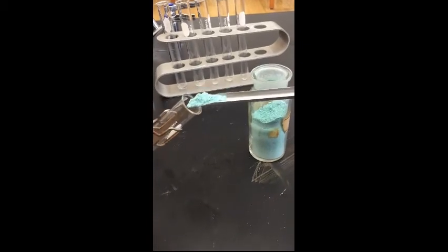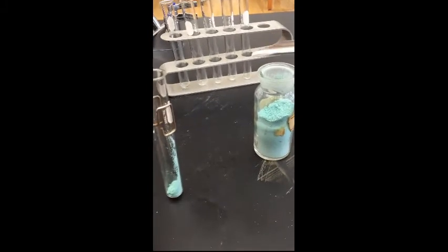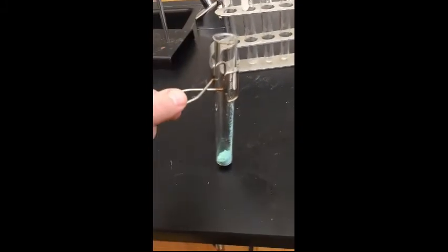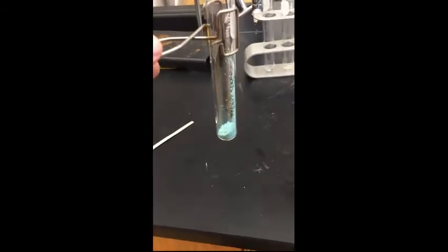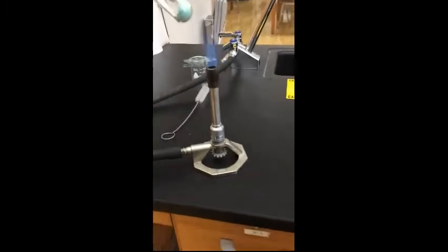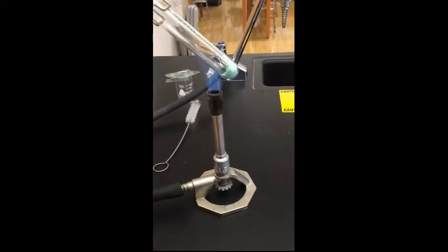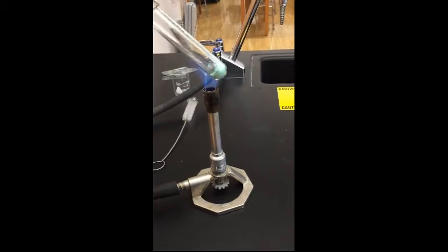So I'm going to put it in the mouth of this test tube, and I'm going to put the cap back on here. Note that when I'm heating something up, I should be going back and forth, especially if it's a liquid.